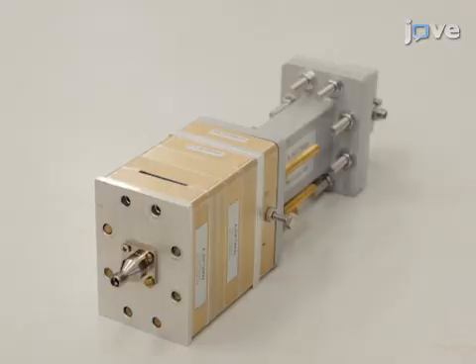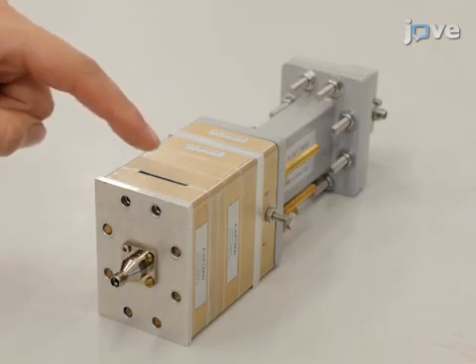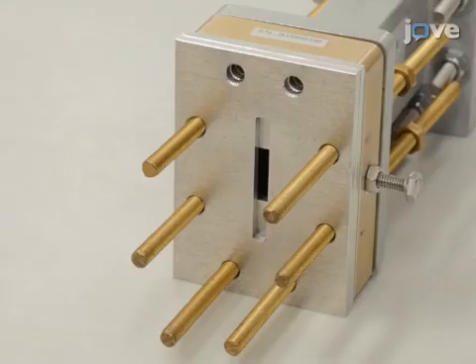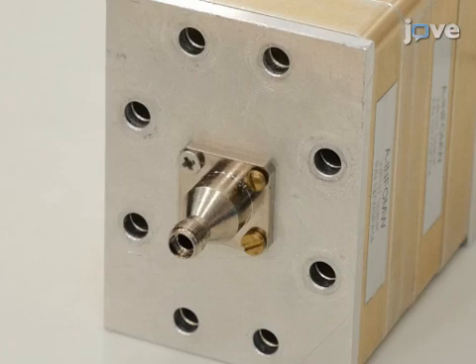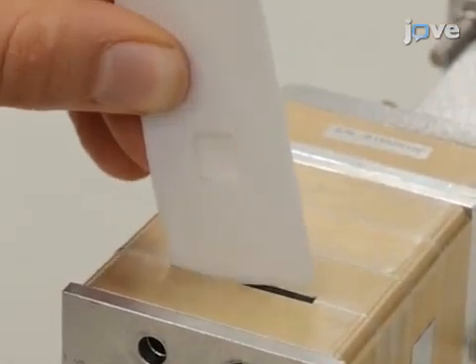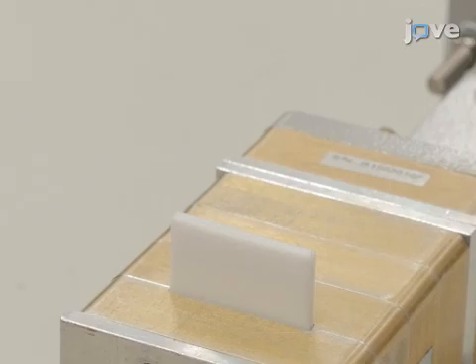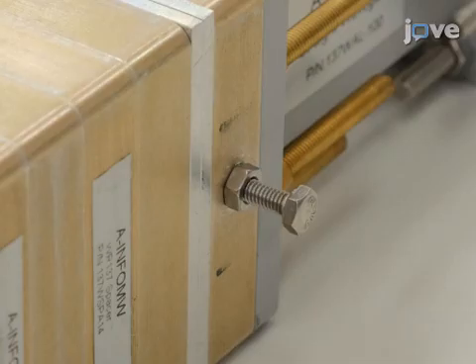The sample will be mounted in this custom microwave cavity, which is made of 4 quarter-wave plates screwed together. An iris couples microwaves into the cavity, and a fiber port on the microwave short allows optical access. A Teflon sample holder slots into the cavity. A diffuser ensures that the incident light is spatially uniform, while a tuning screw modifies the cavity quality factor.